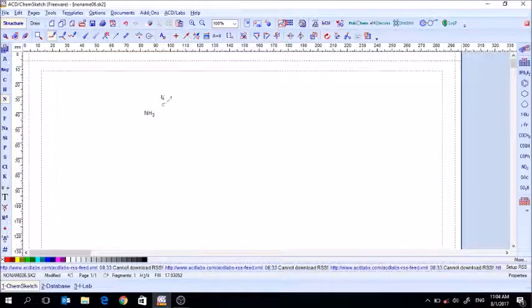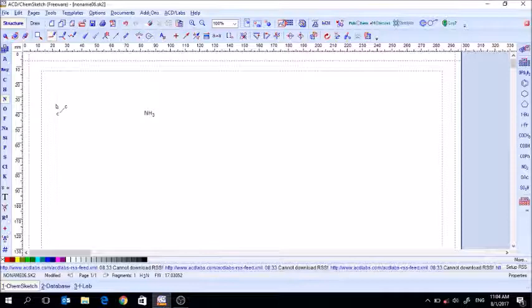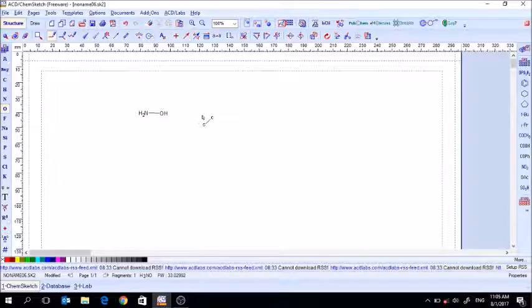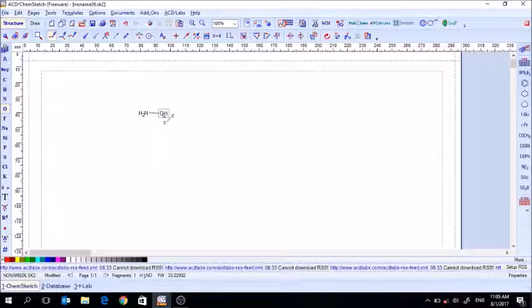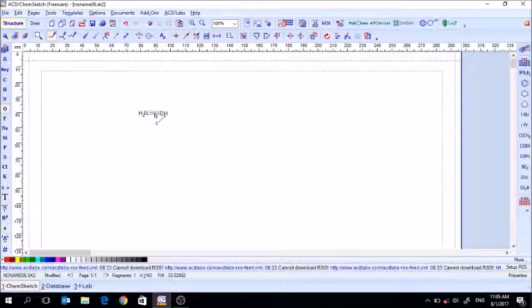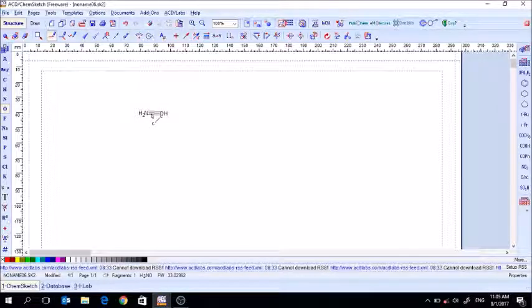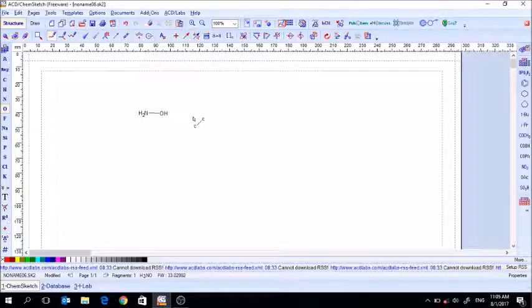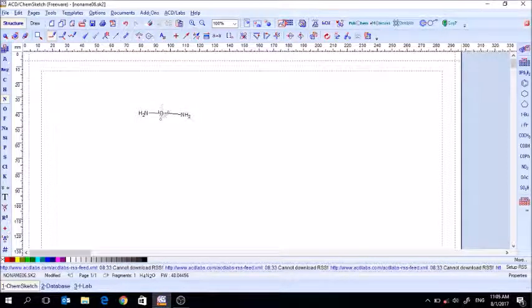Let's start again with nitrogen — click and you'll see you get three hydrogens. Now if you want to add something to it to make another structure, you just start adding to it. You'll notice that adding oxygen replaced one of the hydrogens on nitrogen with the oxygen. Oxygen then has one hydrogen in addition to its covalent bond, and nitrogen has two hydrogens plus its bond to oxygen.